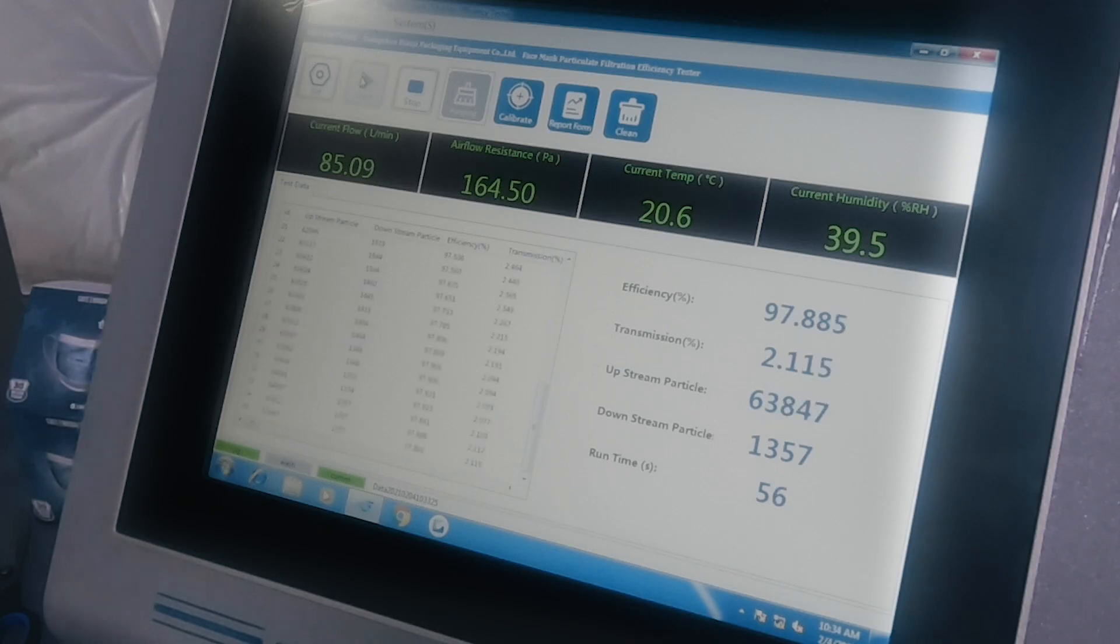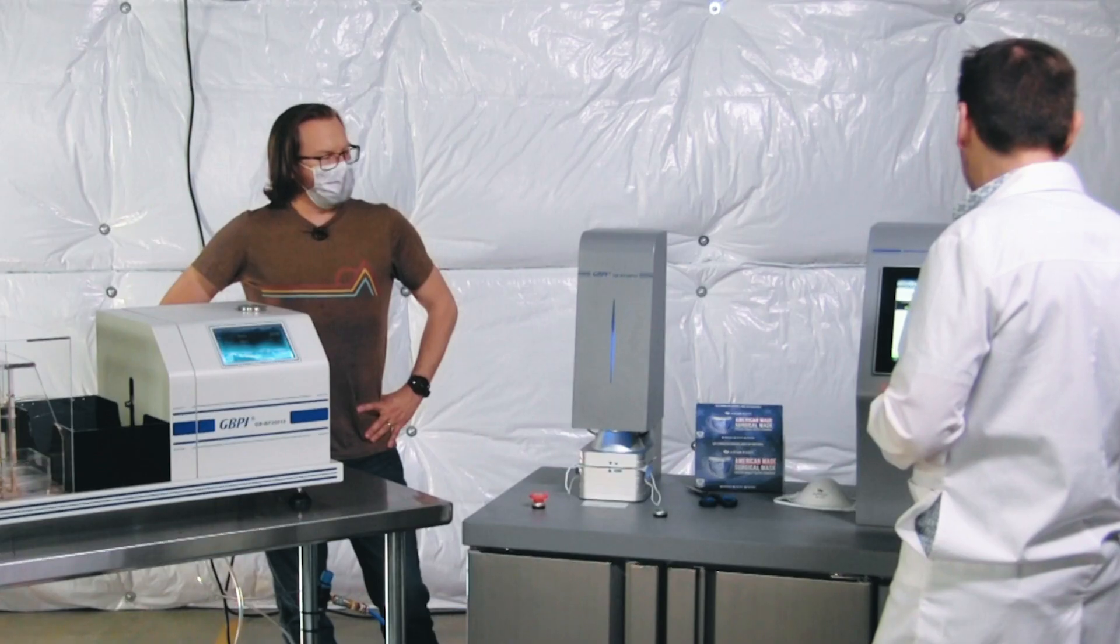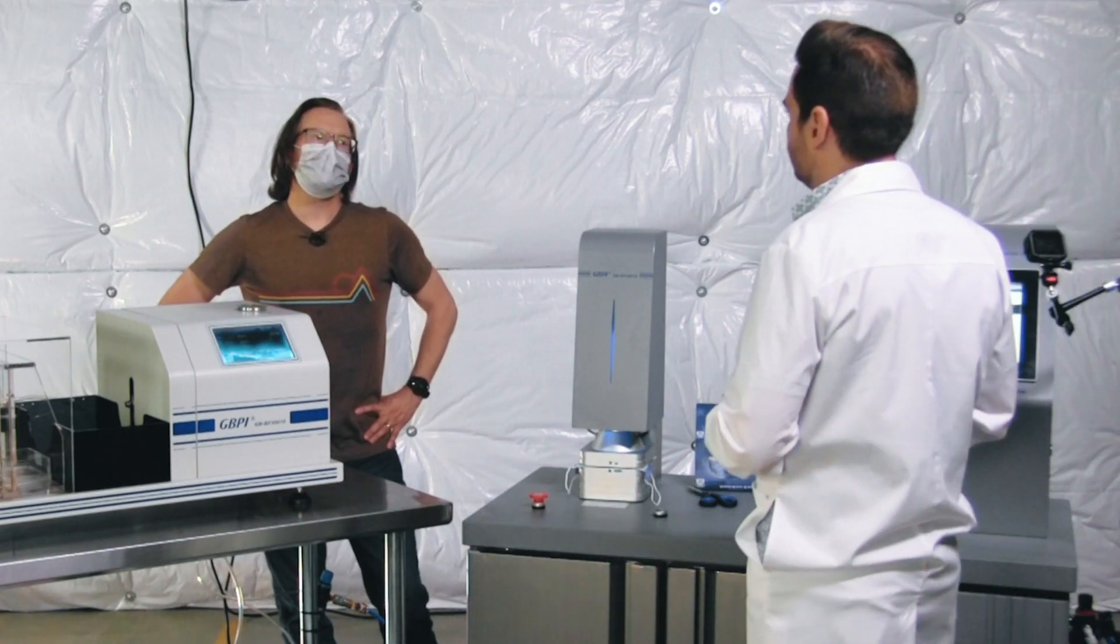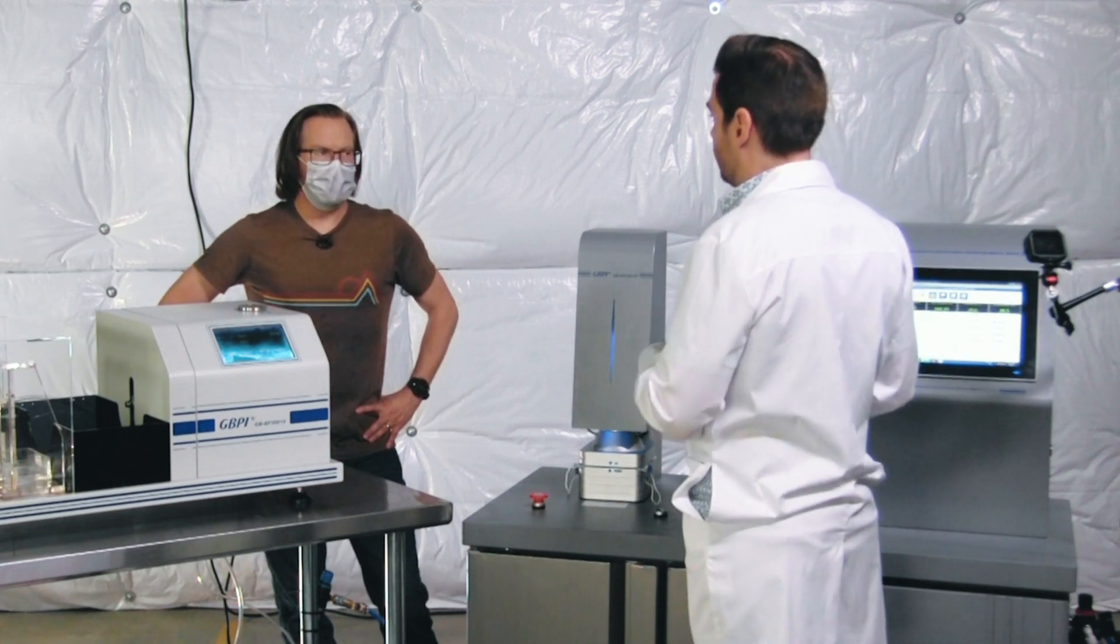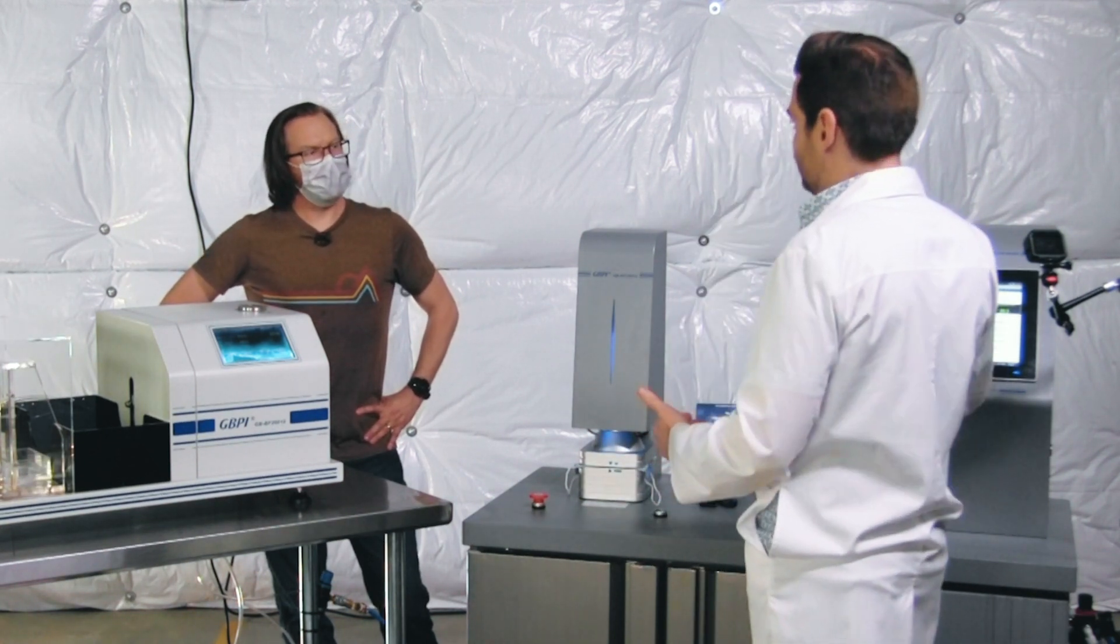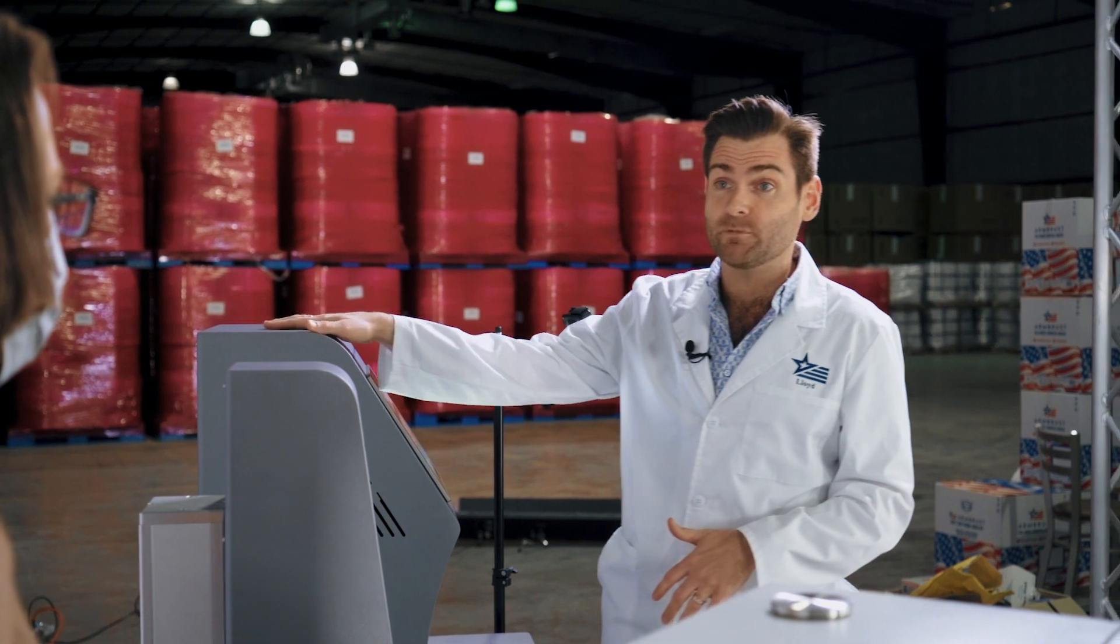So we're at 97.8 right now. And again, we're almost halfway through the test, and so that is going to continue to jump up and down. To pass the ASTM level three, which our masks are, you have to be above 98% filtration. This is a lab machine and it is registered. Of course, you're not allowed to take your own results. Just because I'm wearing a lab coat doesn't mean that I'm a certified lab technician to do this.